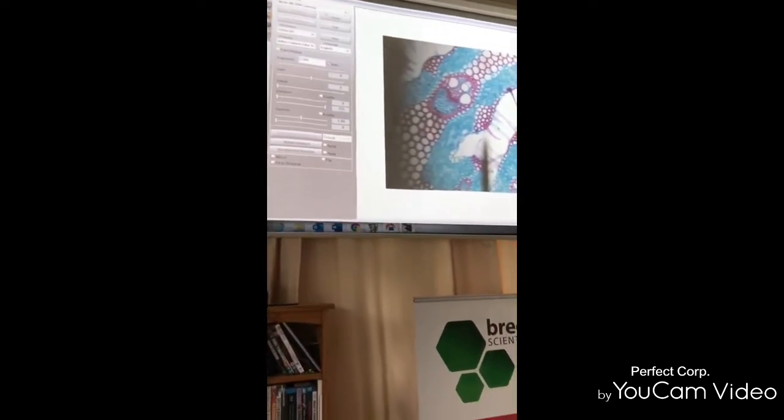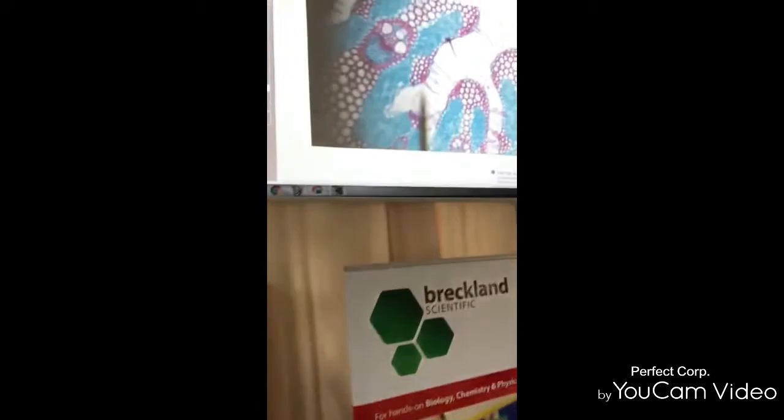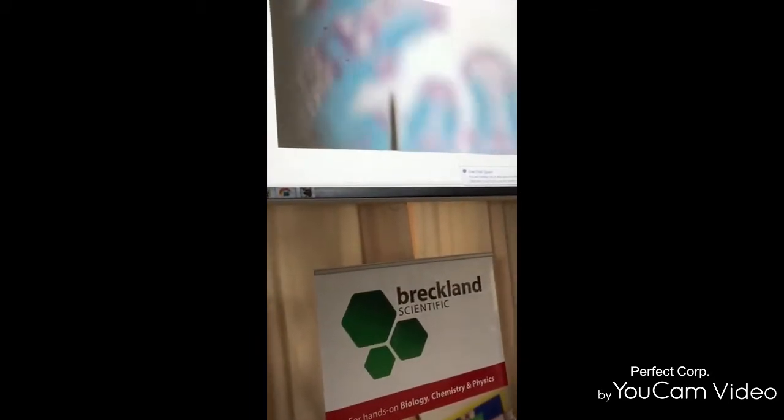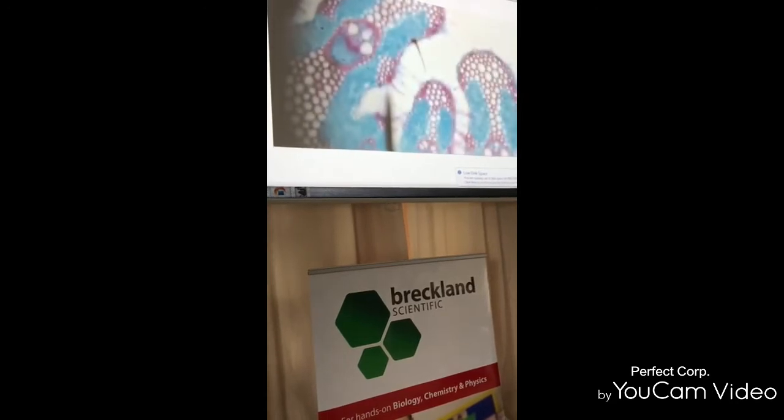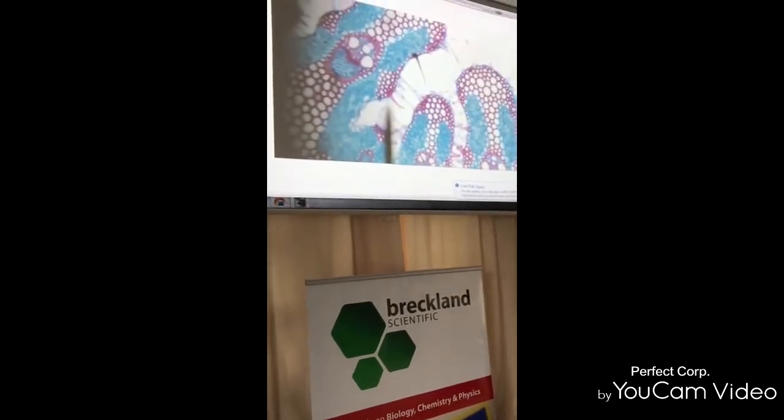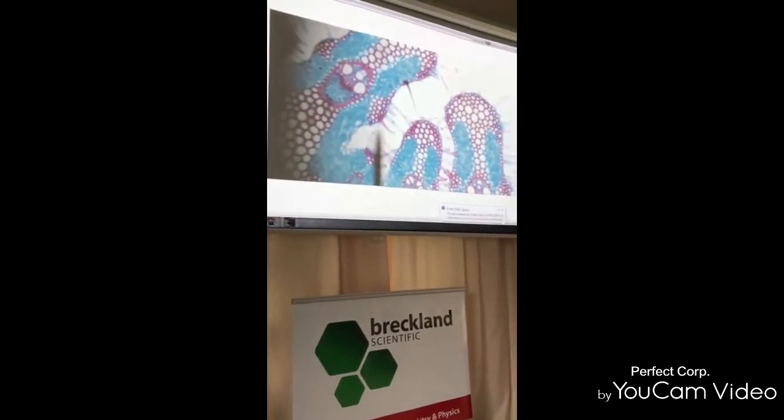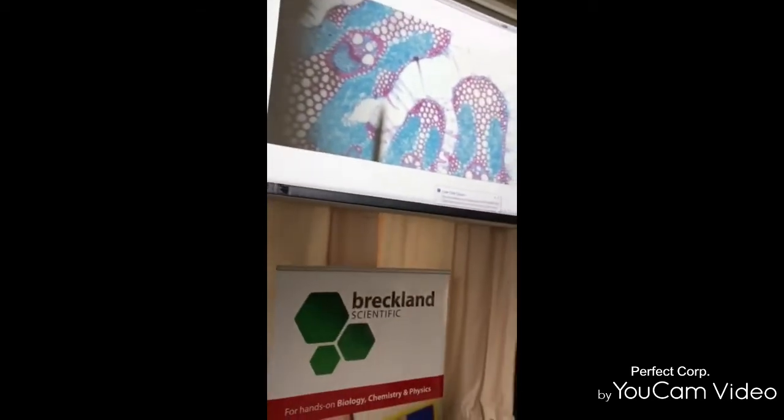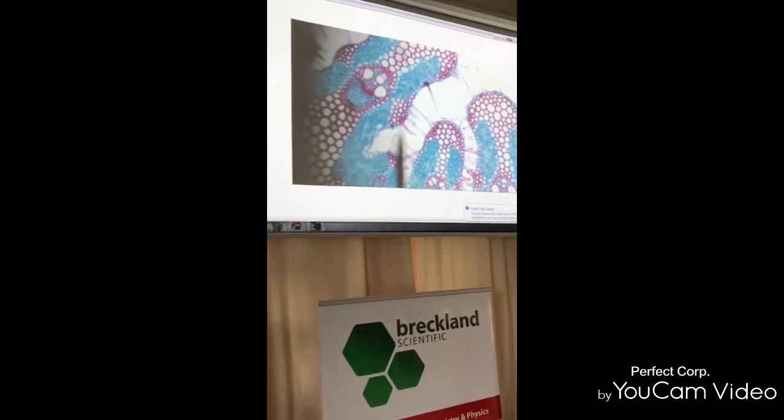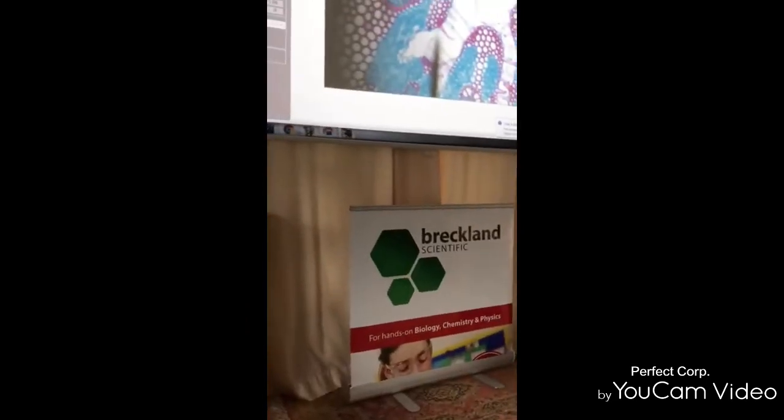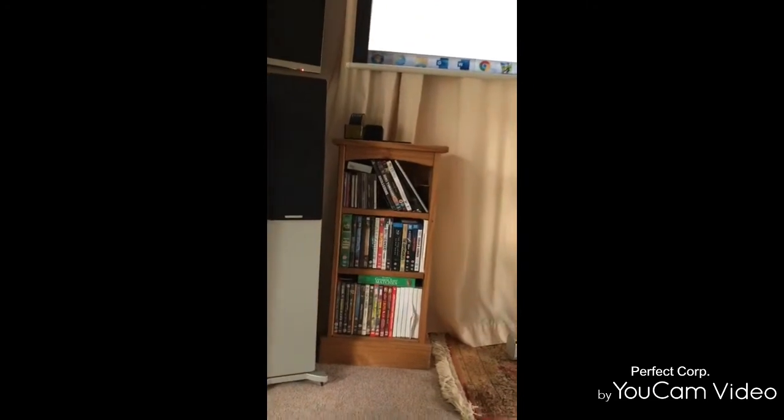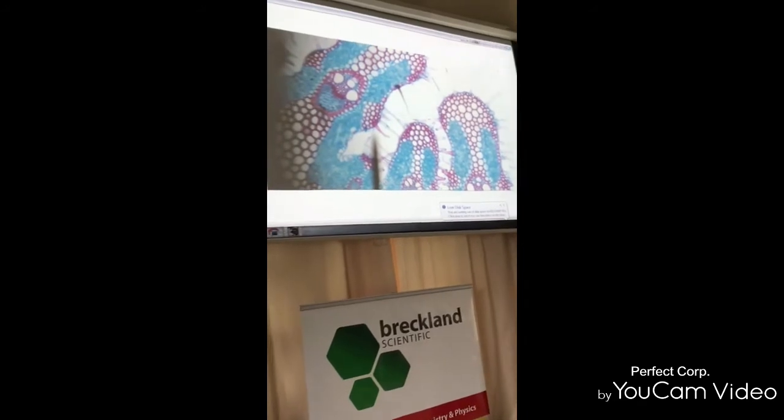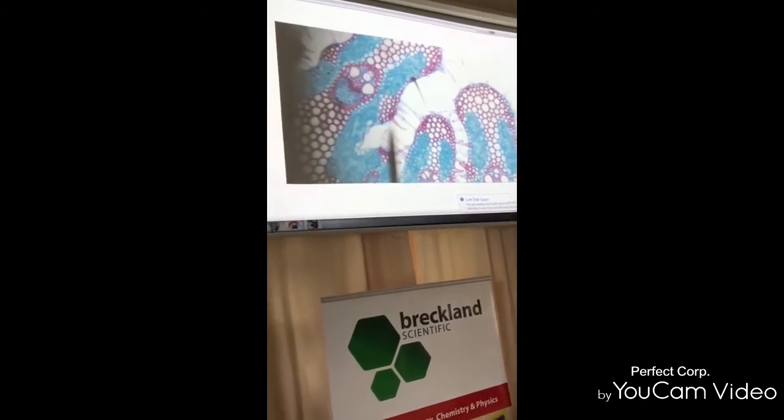You can still focus. The resolution of this camera is 1280x720, but it does give you a very good image.